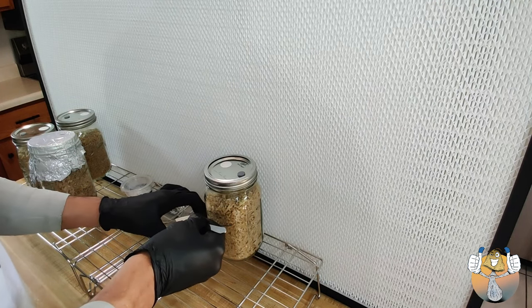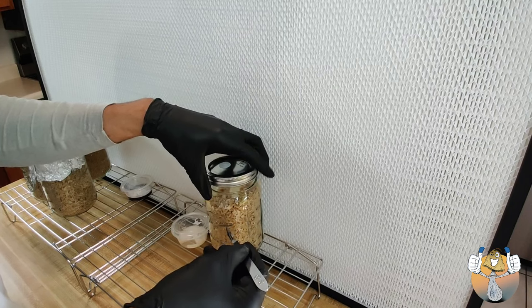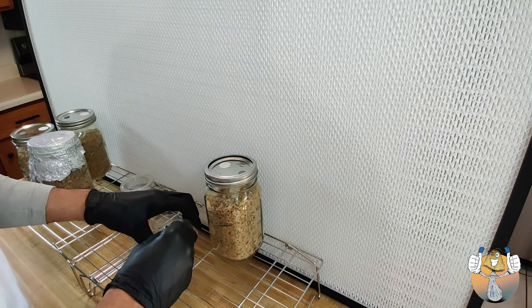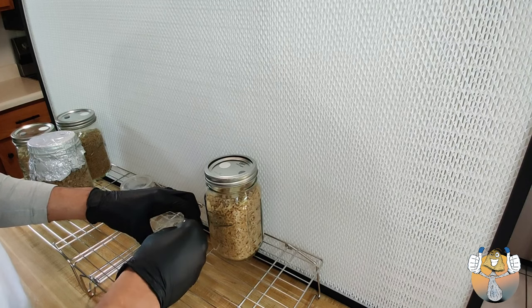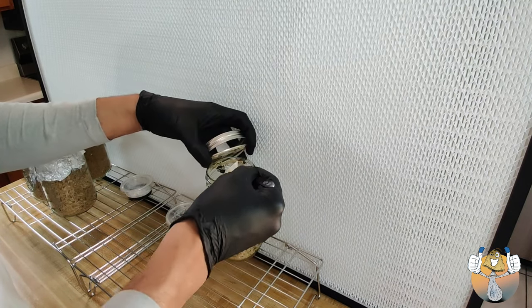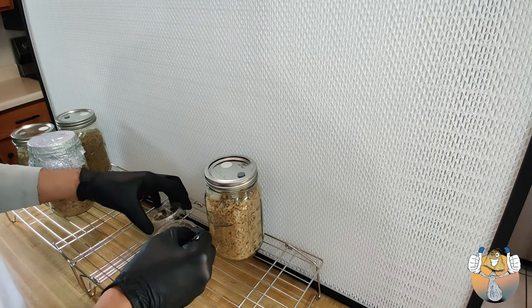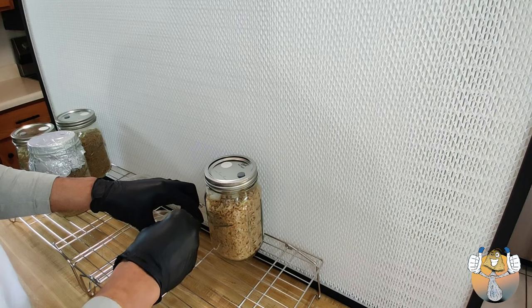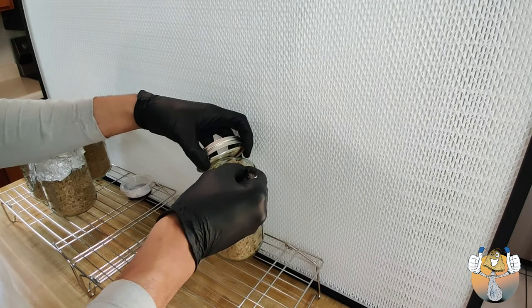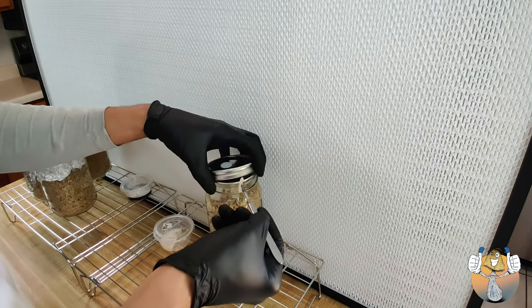And I'm going to add about 3 to 4 chunks of agar to each of our quart jars that we have. Now, if you notice, I did not flame sterilize my scalpel in between the transfers. I'm doing that because I feel like my scalpel is sterilized, the agar dish is sterilized, or the environment that the agar is in is sterile, and my rice should be sterile. So, not too worried about the flame sterilization, but when I move on to a new agar dish, of course, we're going to sterilize and then proceed.